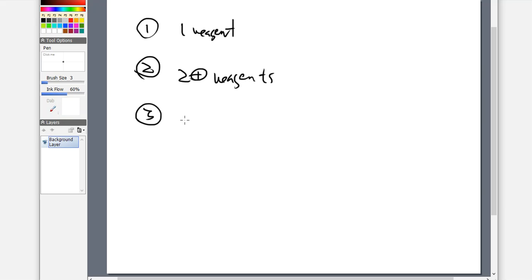Number three, heat is going to be very common, but it does not have to happen every single time. So when we begin to heat the plates, we speed these reactions up. The energy of activation gets lowered. That's the whole purpose of using a catalyst anyway. You don't have to reach the top of the hill, and long, and whew, finally I've reached the top, and then all the way down after that. The hill becomes lower, so you don't have to trek as far up. So heat is going to be a common situation that speeds these reactions up quicker, so that way I can get the imaging a little bit faster.